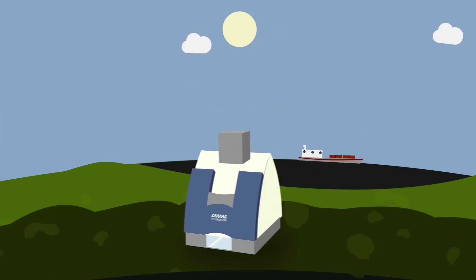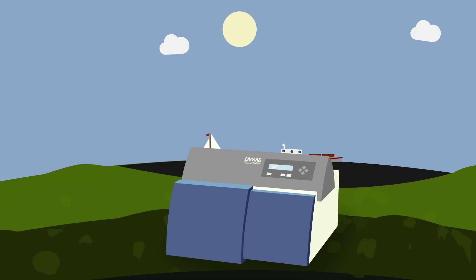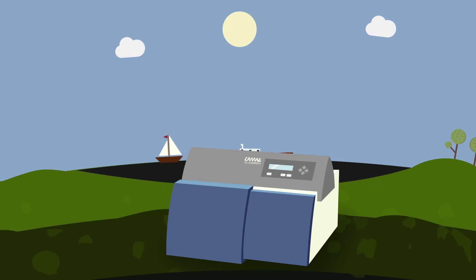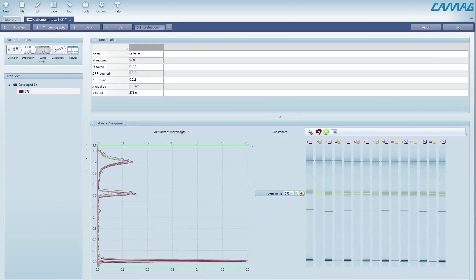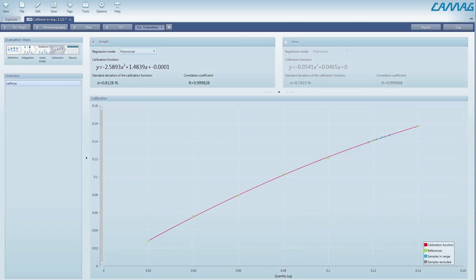VisionCats controls the TLC scanner and enables quantitative evaluation of the generated densitometric data. Easily perform substance assignment of each separated compound at its optimum wavelength. Choose the best fitting calibration model for evaluation and quantify via peak height or area.